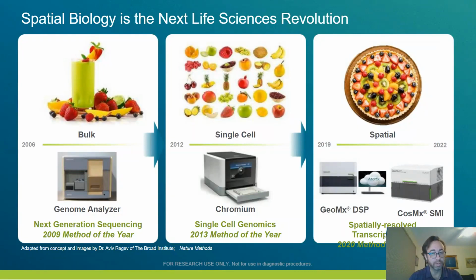terms of information. And here, this is lifted and adapted from Aviv Regev's slide, where she's describing this as basically drinking a smoothie. You got a sense of all the components that are in there, but you don't really know all the different pieces of it. And there might be some that you underappreciate because they're not very common.